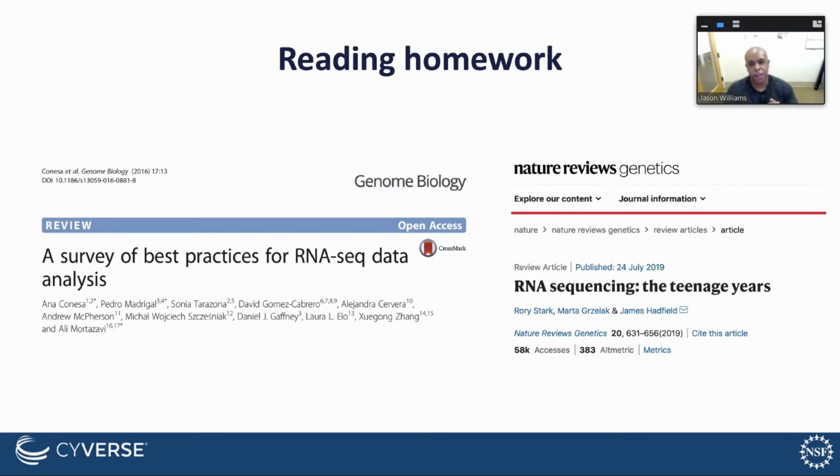There are 2 papers that I actually recommend, so I'm keeping this up for just a second to think about this in the background. There's an older one, the 2016 one from Conesa et al., a survey of best practices for RNA Seq. Of course, the technology has changed. Of course, things have been updated, but this still is pretty much a really nice survey, all in one place, of practices that are really still what you need to be doing. Again, if you were using single cell, there's a new set of practices that you might want to also think about, but still, I think a lot of the fundamentals are there. And then this more updated one, 2019 from Stark et al.